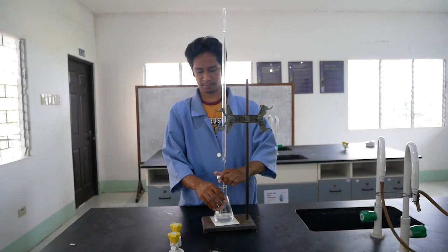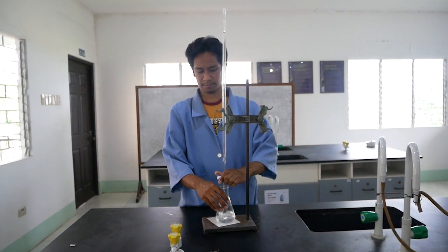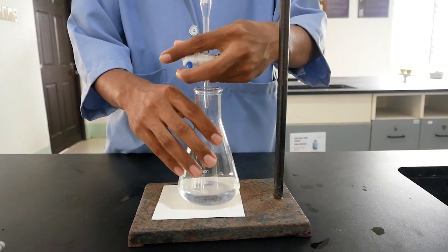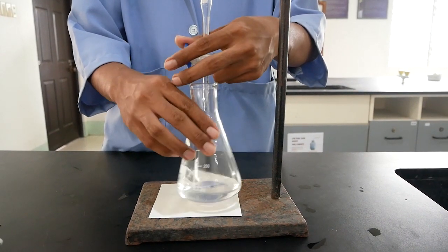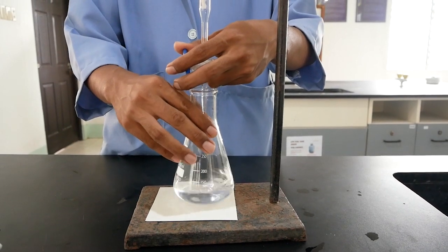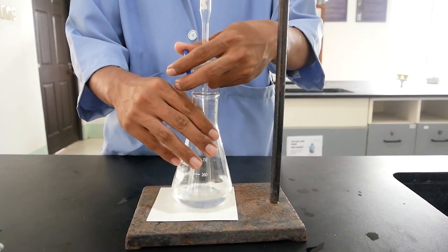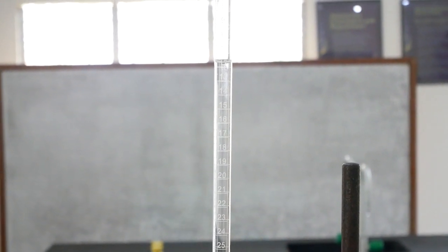Start titrating by slowly opening the burette stopcock and allowing the titrant to mix with the analyte. Make swirling motions with one hand while the other hand controls the drip by opening and closing the stopcock. The level of the titrant in the burette goes down accordingly.